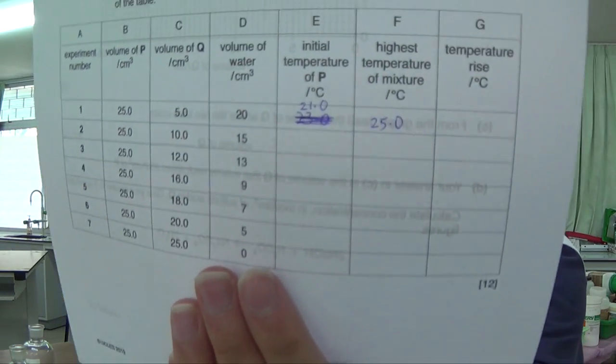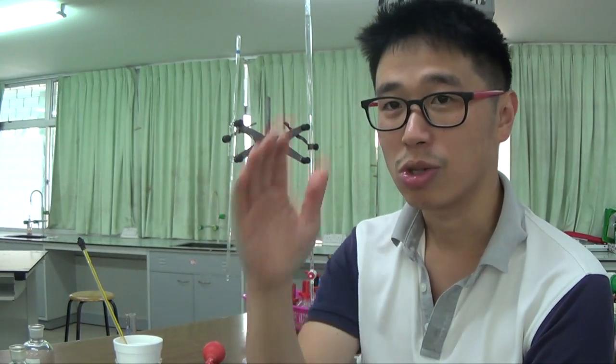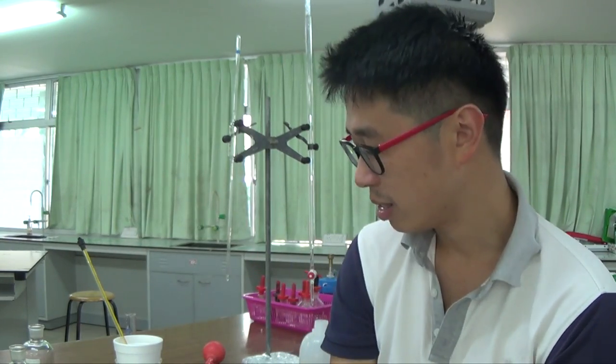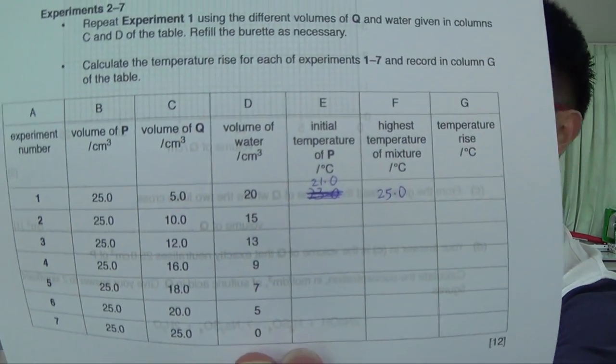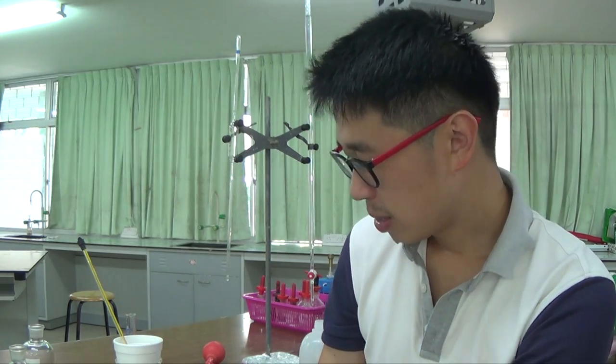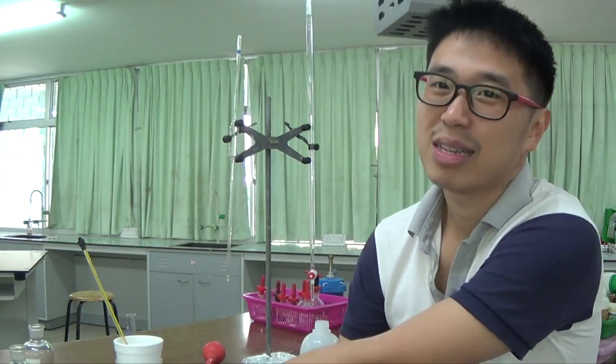Actually, 25.0 degrees Celsius. What we have then is we measure the initial temperature, we measure the final temperature, we calculate the temperature rise. We do not measure temperature rise. The thermometer does not measure the change in temperature. It measures the initial, the final, and then you put into a calculator: the final temperature minus the initial temperature. So when you press the calculator, 25.0 minus 21.0, the most common mistake a lot of students make is they will get 4. This is what the calculator will show you. That's it, okay?